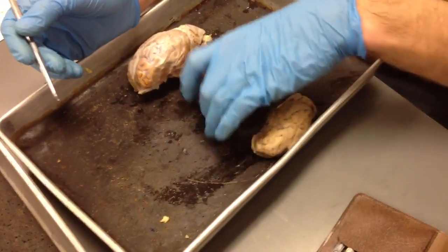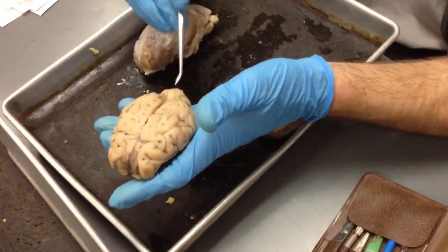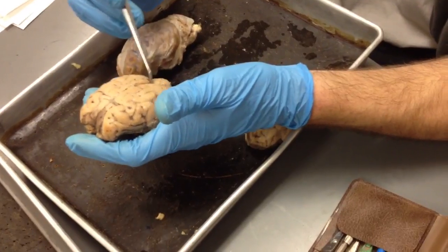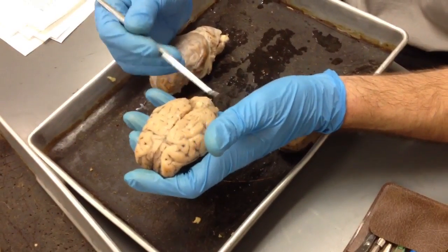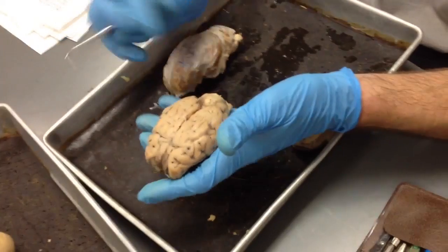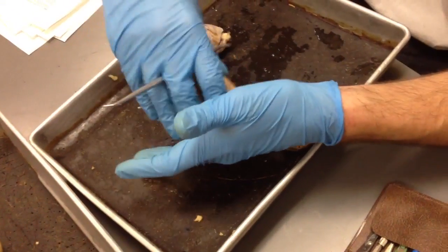Cerebral hemispheres. So we have two cerebral hemispheres making up a cerebral cortex, a cerebellum posterior, a longitudinal fissure splitting our hemispheres, and a transverse fissure splitting our cerebellum from our cerebral cortex. So cerebellum, cerebral hemisphere, cerebral cortex together.